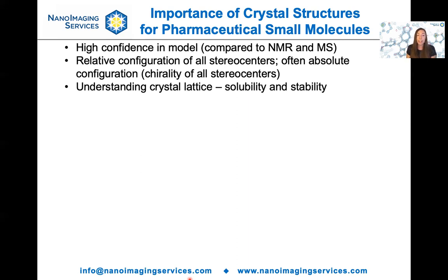Additionally, understanding the crystal lattice that is forming these crystals is of great importance for those working in the formulation space, as the lattice properties greatly impact things like solubility and stability, leading to differences in pharmacokinetics, which are very important for the pharmaceutical industry.